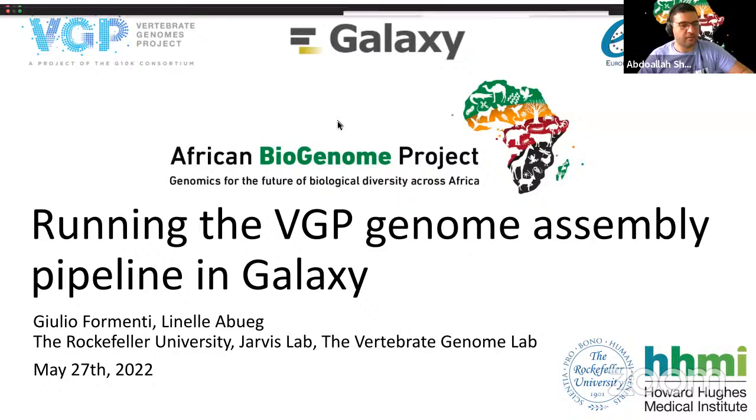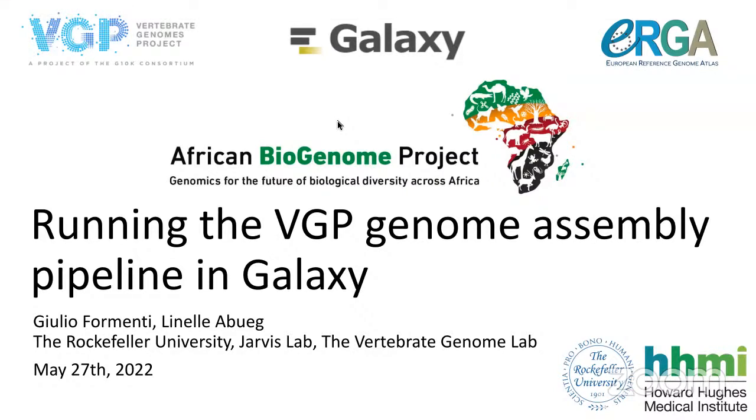All right. So today we would like to talk about the Vertebrate Genomes Project pipeline that was developed as part of a collaboration between the Vertebrate Genomes Project and the European Reference Genome Atlas. And hopefully we'll also see some examples of data sets that were generated as part of the Africa Biogenome Project, and we will comment on them.